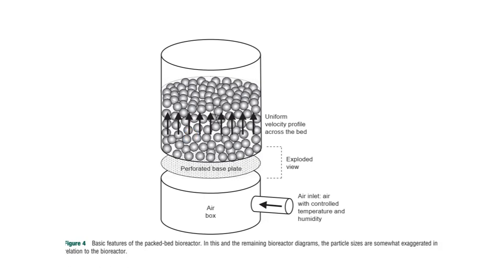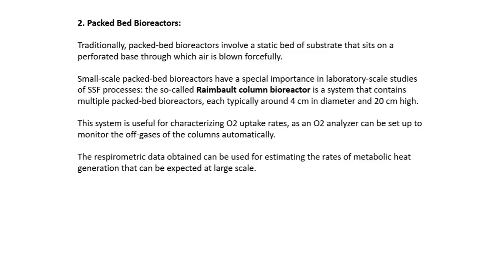All the substrate is porous. That means it may have some spaces in between, so the air is passed through that. The substrate is completely aerated and can be supplied with oxygen, that means air. It's very simple. So, going to the previous slide: small scale packed bed bioreactors have a special importance in laboratory scale studies of SSF, solid state fermentation.